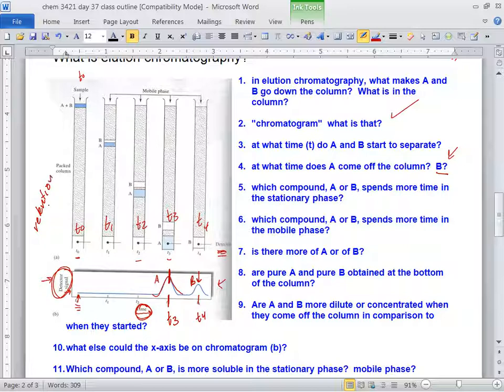You know what's kind of interesting? This is the real power in chromatography, and this is where it gets really expensive too: the retention times. For this to be a useful technique, would you want the retention time to change? Say you're going to analyze somebody's blood for cocaine, and you're earning big bucks because you know how to operate a high-performance liquid chromatograph with a mass spectral detector. And you know cocaine comes off in somebody's blood at 2.8 minutes. If it always came off at 2.8 minutes, you know how much easier your life would be? You see a little peak at 2.8. Ah, bad boy.